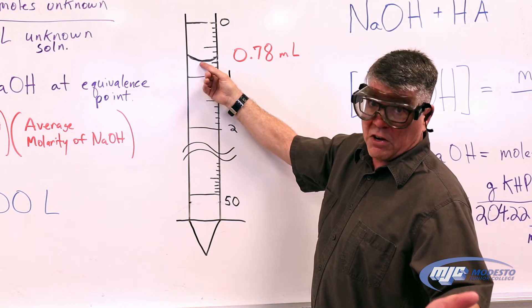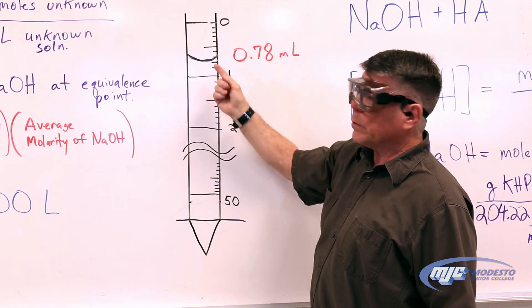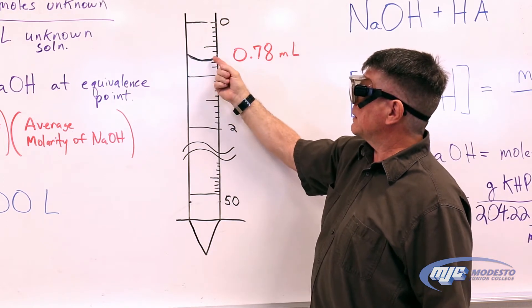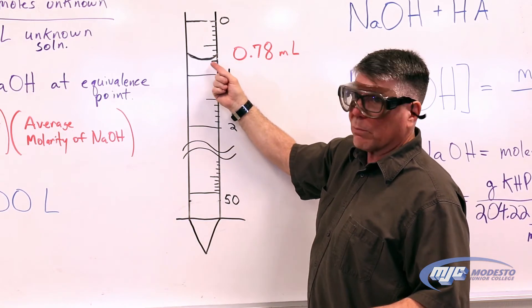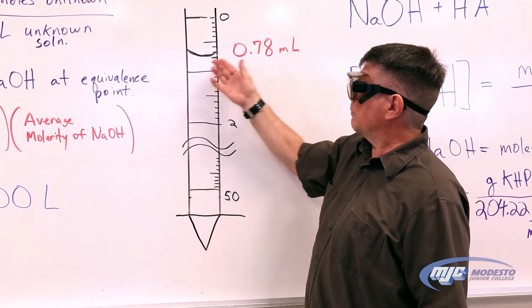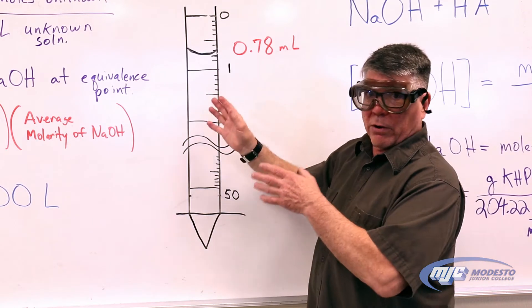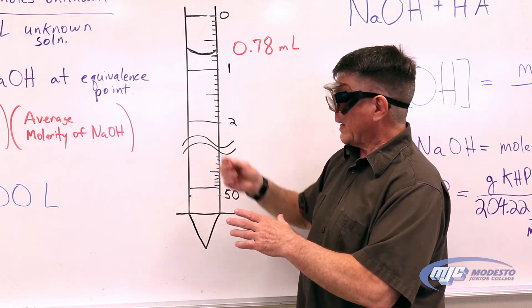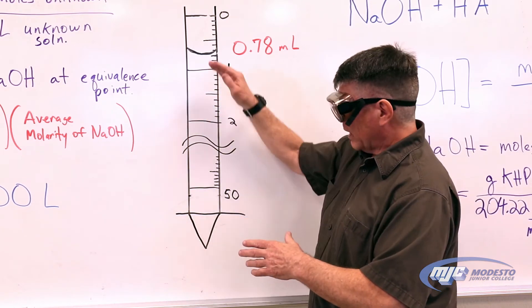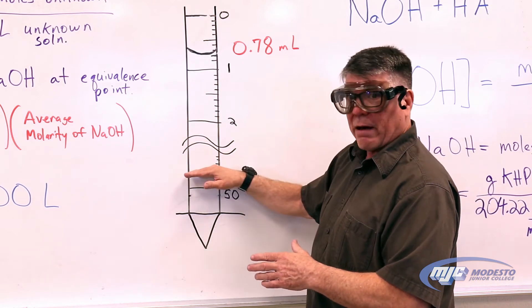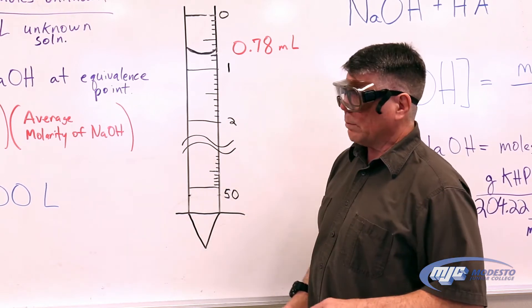So this might be our initial volume — between 0 and 1, so 0.7, and I estimate that's about 80% of the way between the two marks, so I'd call it 0.78 milliliters. We do our titration, adding the sodium hydroxide from the burette to the acid underneath. When we stop, we read that final volume the same way, and the difference between final and initial is the volume added. That's how you use the burette.